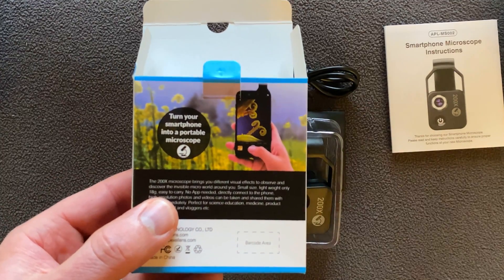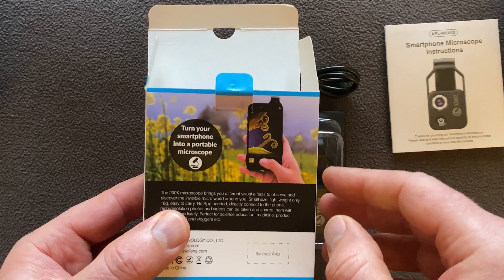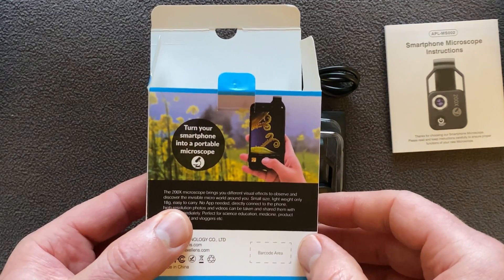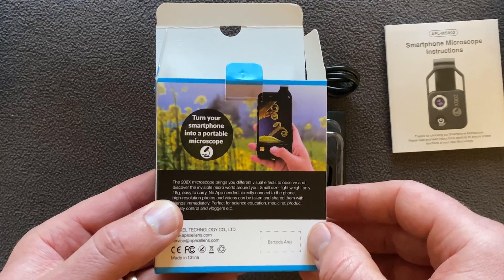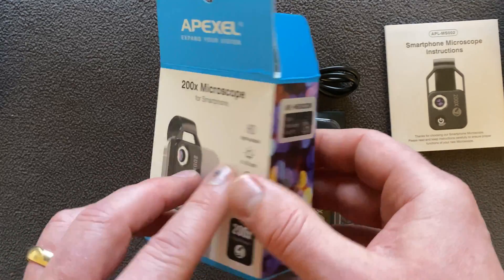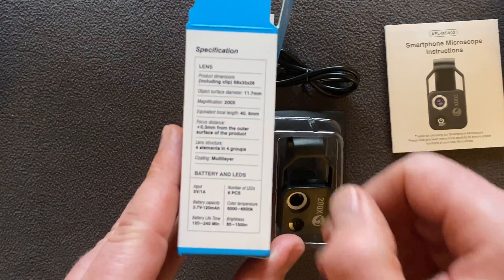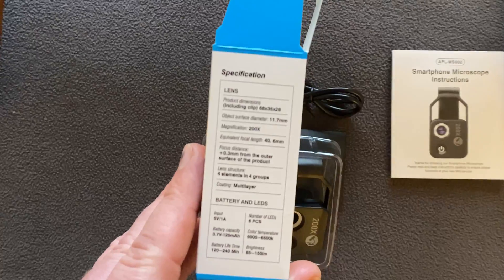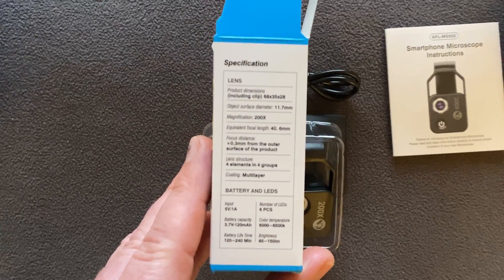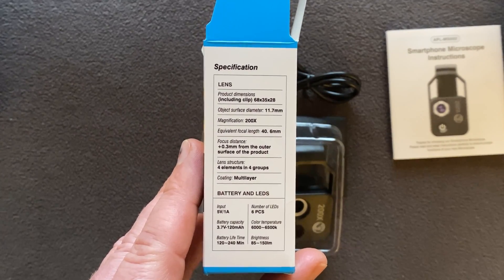On the back of the box you can see test photos of plants — this is the sort of thing you can get. It says 'turn your smartphone into a portable microscope.' I've seen some of the photos that are capable with this thing, and this is really exciting. If it works out to be as powerful as it claims, then this is going to be amazing.